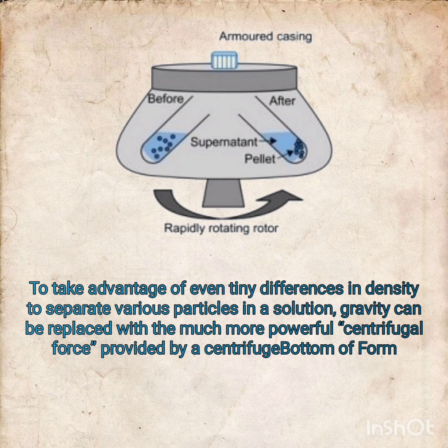Here is another diagram, a rapidly rotating rotor. Here is a sketch of the rotor, which is inside the centrifugation machine called a centrifuge, used for separating material by applying centrifugal force on the particles. Look at the diagram. Before, the particles are suspended in the liquid, and after, the particles are sedimented at the corner or at the bottom of the solution, and the liquid is cleaned out.